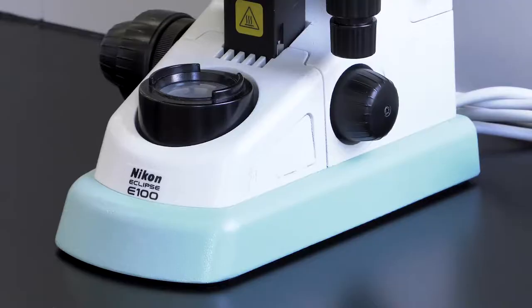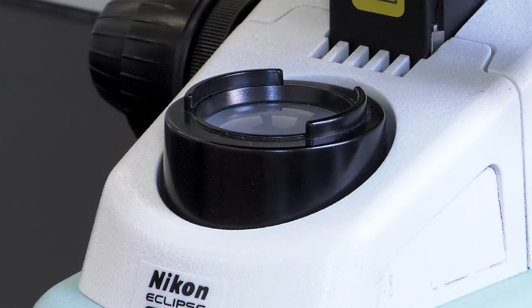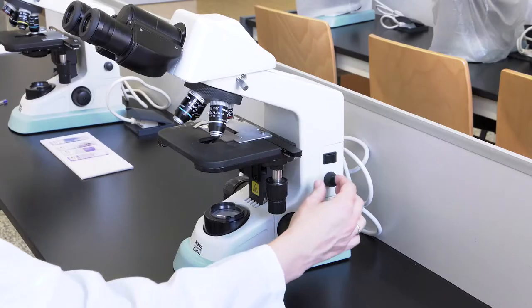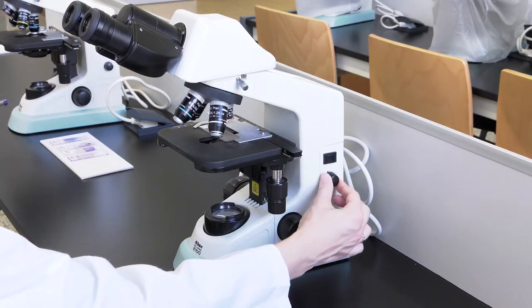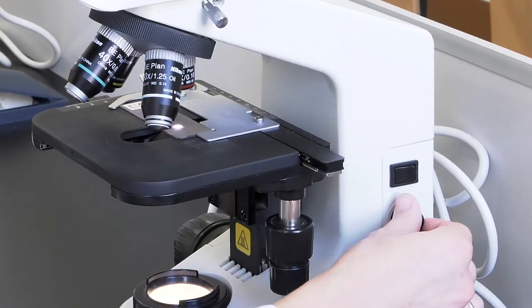Let's look at the base again. On it, there is an element of great importance, the light source. It contains a lamp which emits white light. When you turn the power switch on and adjust its intensity, the light will be projected upwards, penetrating the condenser lens.